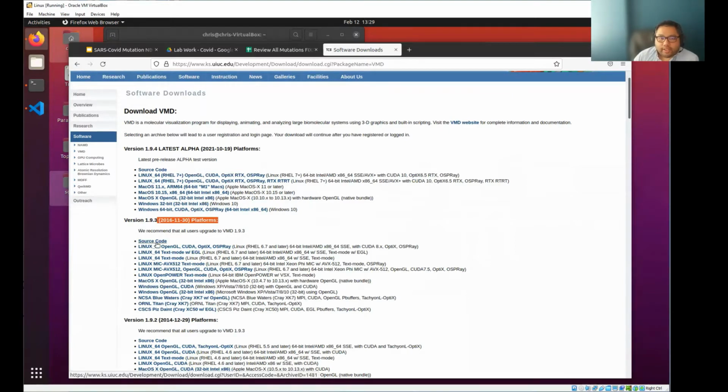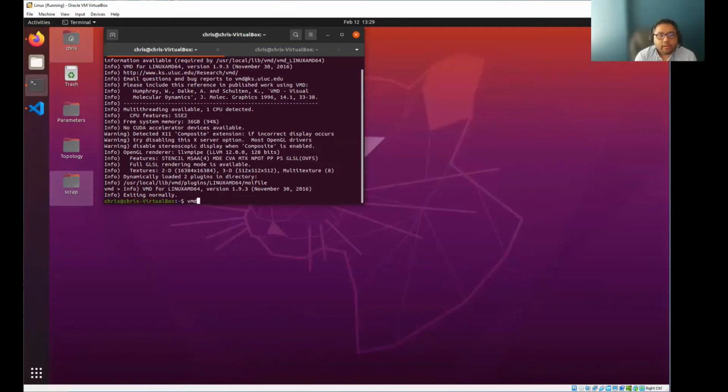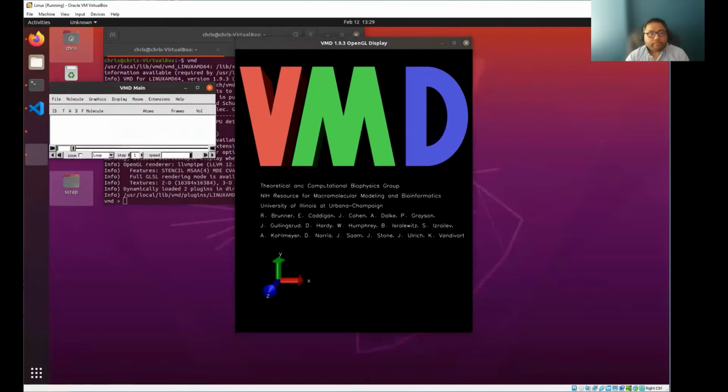But once you download that, as Dr. Valfar says, it's freeware. So anybody could just pick it up and load it onto their particular system. Once you get it, install it, and we'll load it up.